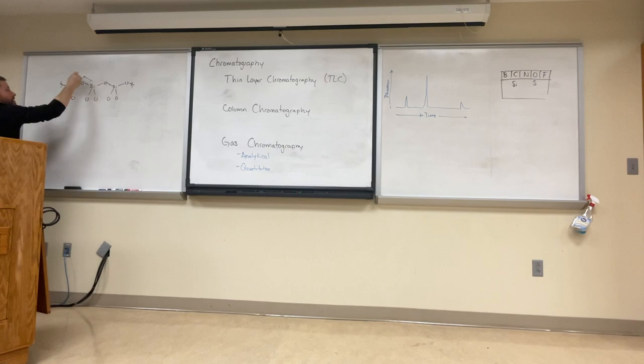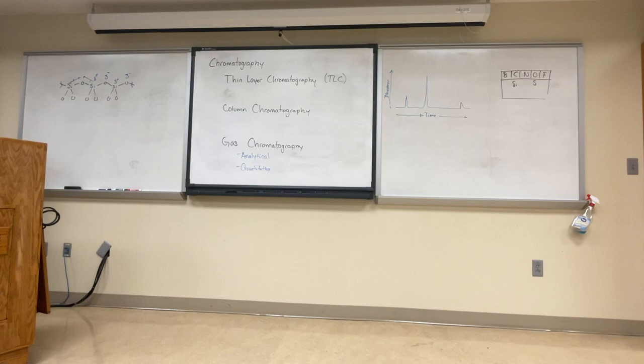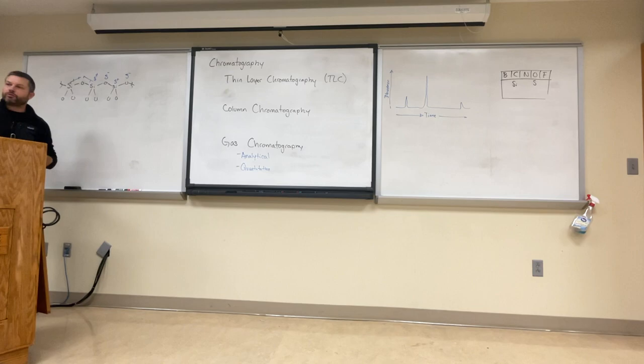But what that means is that silicon is going to be electron poor, and all these oxygens are going to be electron rich. So when you think about that silicon coating on the top side of these TLC plates interacting with other molecules, what are the major intermolecular interactions that this can have? Dipole.